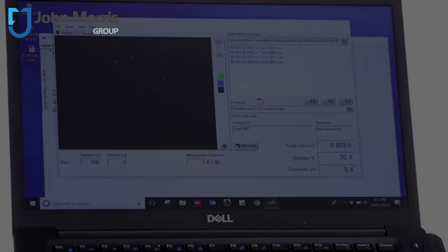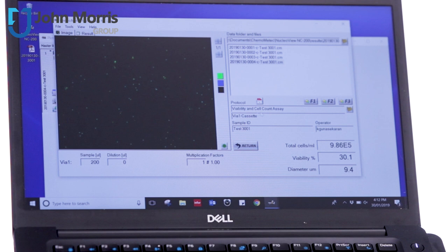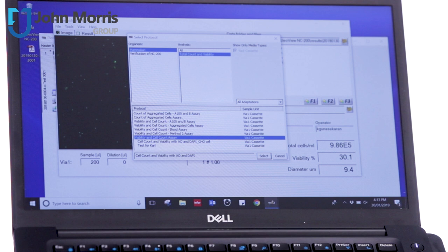There's a couple of other really nice features as well. You can see here that we've used a viability and cell count assay, but there are a range of other assays that the NC200 has available. And you can see a list of some of them right here.